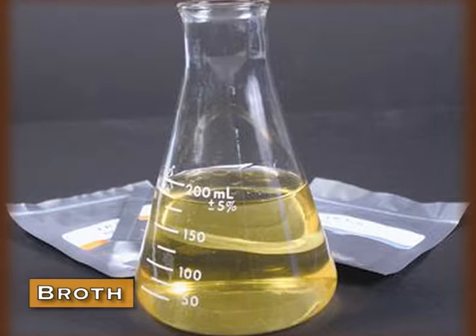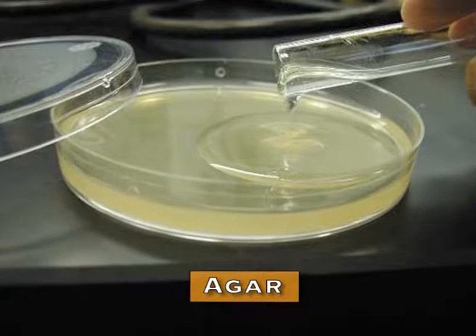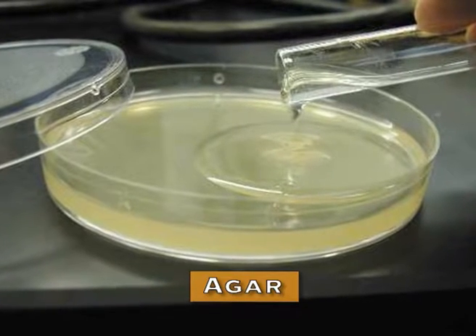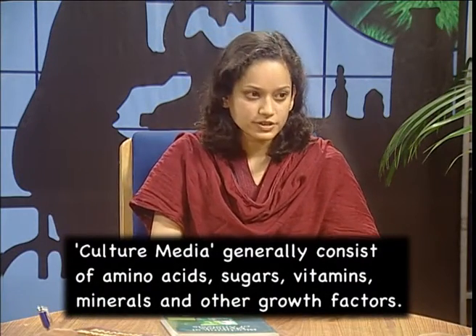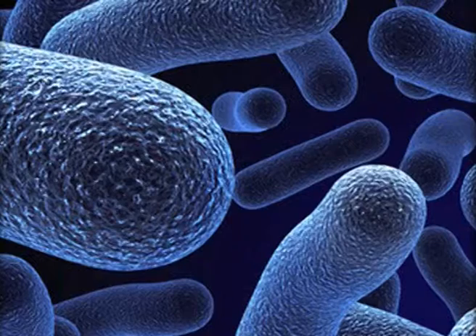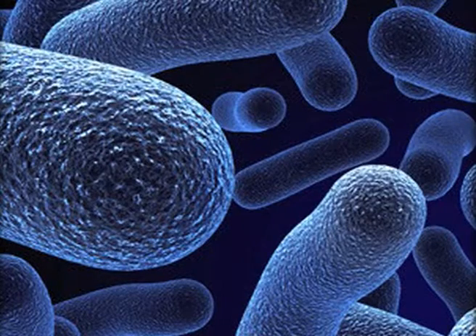How? Now suppose the culture medium which we are preparing, we want to grow bacteria in liquid culture, which is known as broth in microbiology. So the bacteria grow in them and multiply and form a bacterial suspension culture. If we grow bacteria on semi-solid medium with the help of agar, the bacteria will grow and produce discrete colonies. Now, what is culture medium? Culture medium generally consists of amino acids, sugars, vitamins, minerals, and other growth factors. These kinds of materials are required by the bacteria.